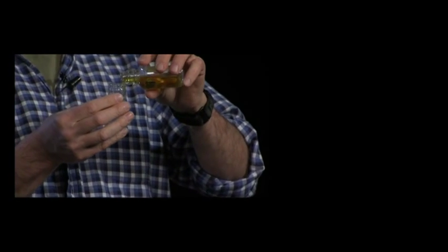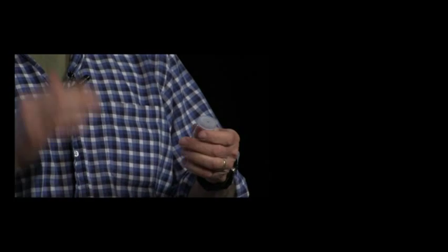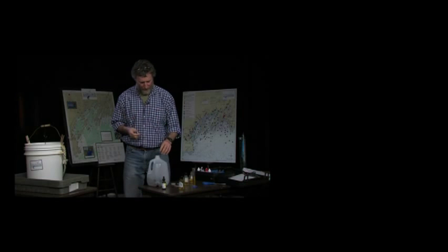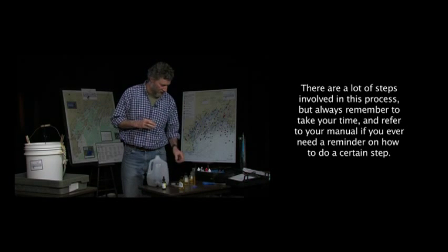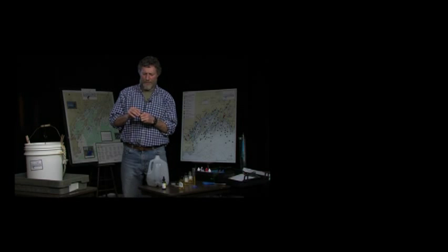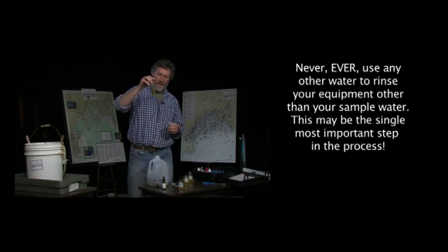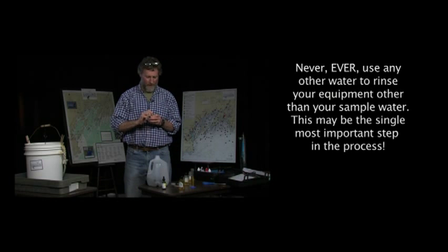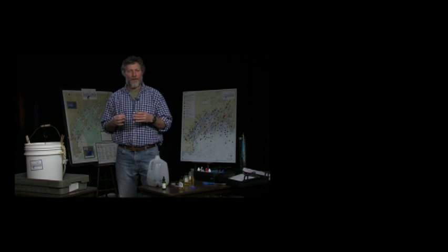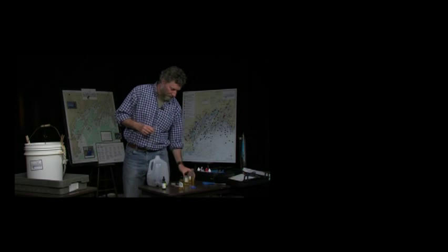One of the things to keep in mind is when you read through this in the instruction manual, there are step-by-step clear instructions of how to do it, and you can actually use that every time when you go to do your processing for your dissolved oxygen test, when you do your titrations. One thing to keep in mind is it says to rinse your titration tube. And a common mistake that I see people do is they'll actually rinse the tube with fresh water or with tap water from the sink, or they'll rinse the graduated cylinder with tap water before they go to do their testing. Don't do that, because what will happen is you'll introduce tap water or fresh water into the whole system, and it will give you readings that are all over the park. So you really don't want to do that.